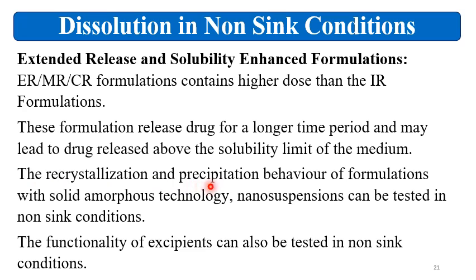The recrystallization and precipitation behavior of the formulation with solid amorphous technology, that is solid dispersion technology, nano suspension technology, or in the solubility enhanced formulations, these formulations can be tested into the non-sink conditions, and these non-sink conditions will be more predictive for in vivo performance of the formulation for these type of formulations.